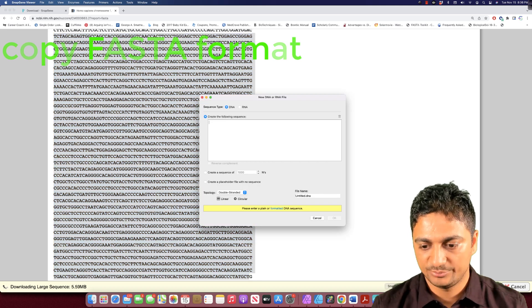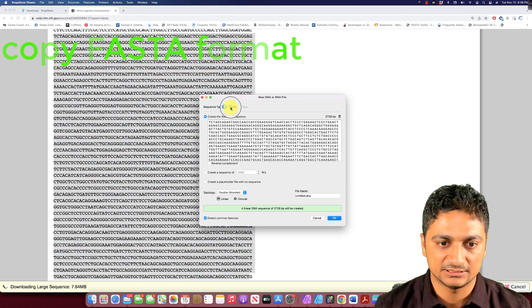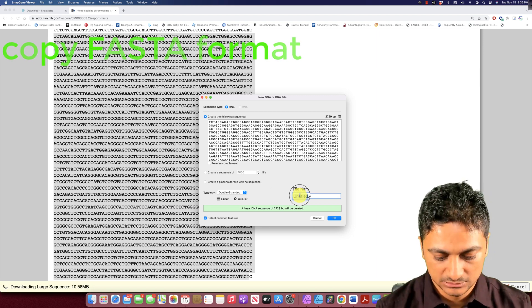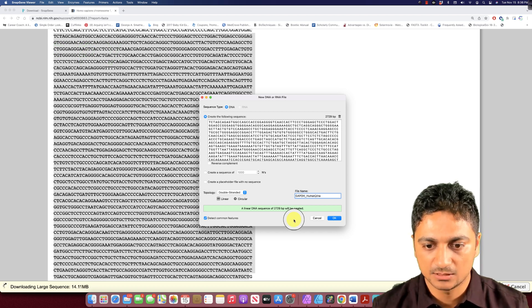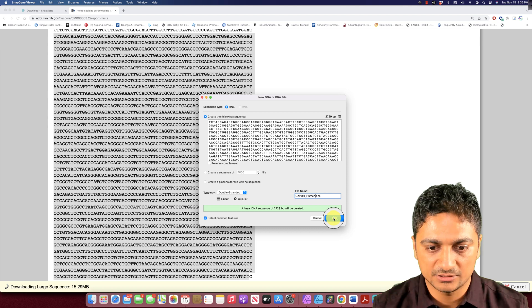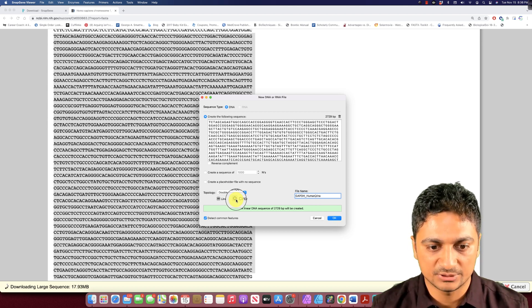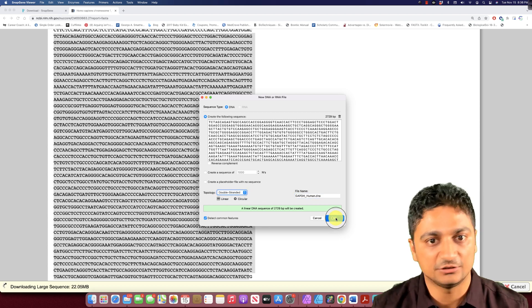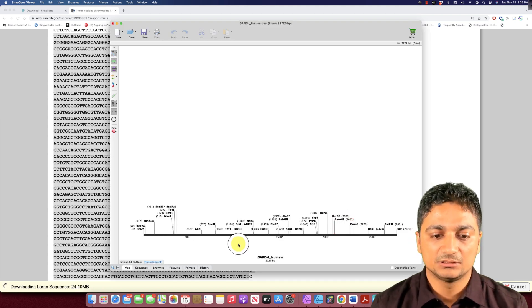We can paste the copied sequence into the new file in SnapGene Viewer. You can name it — I'll name it GAPDH human. This 2,700 base pair nucleotide sequence is going to be created. It is a linear version; you can make it circular or single-stranded, but I'll leave it double-stranded and linear so it will be easier to work on.